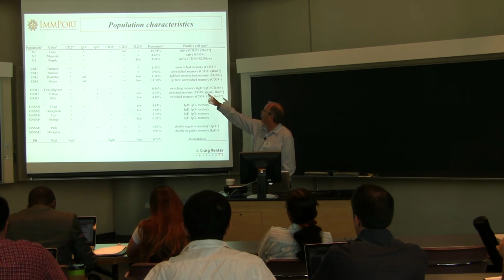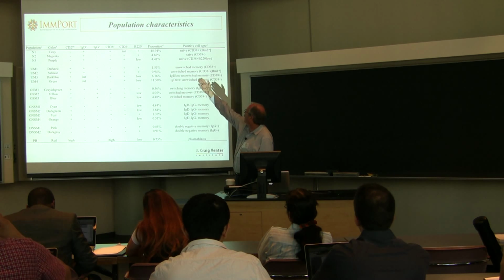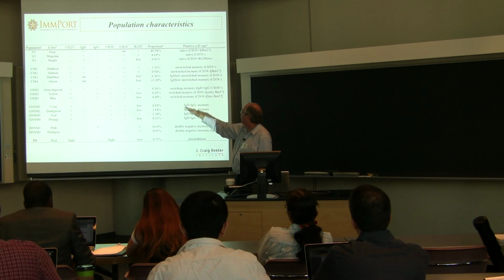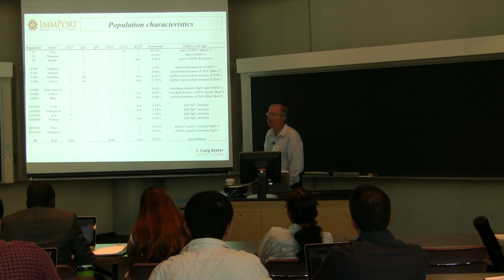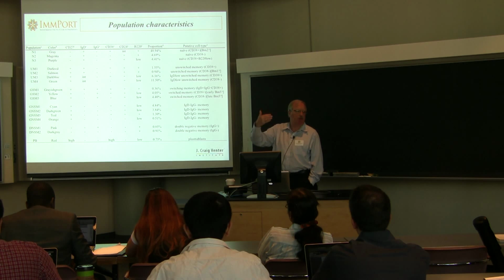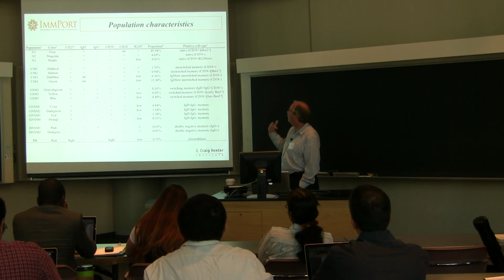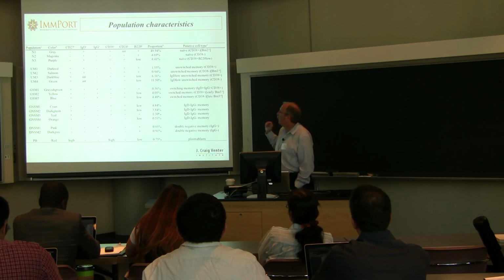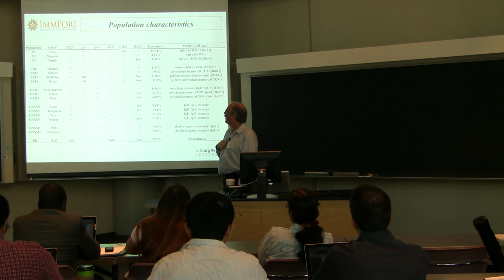And so what we found is that we could identify populations that looked like they were naive B cells, unswitched memory B cells, switched memory B cells, other kinds of memory B cells, plasmablasts, and plasma cells. So we could match these cell populations to known cell types that have been reported in the literature. But in addition, we were subdividing them further based on these additional markers. They really are distinct populations when you look at the distribution of the staining intensities.